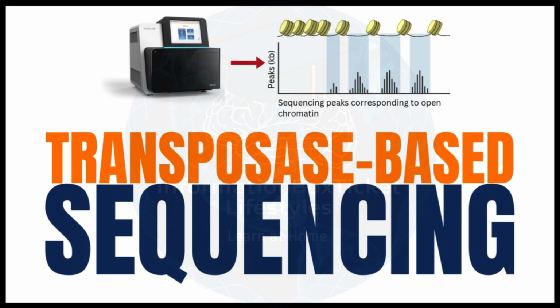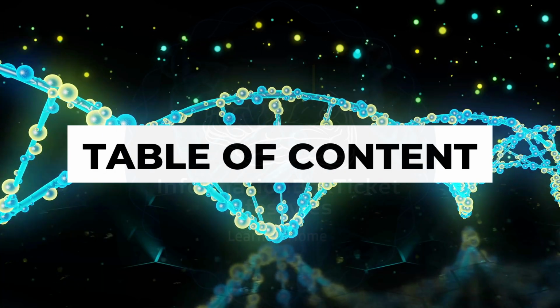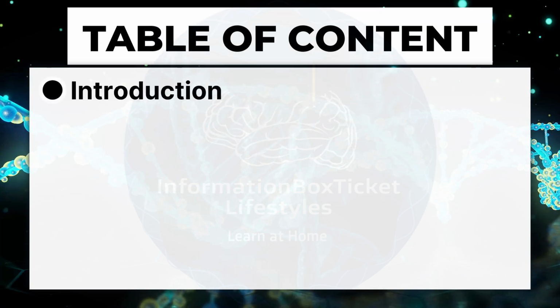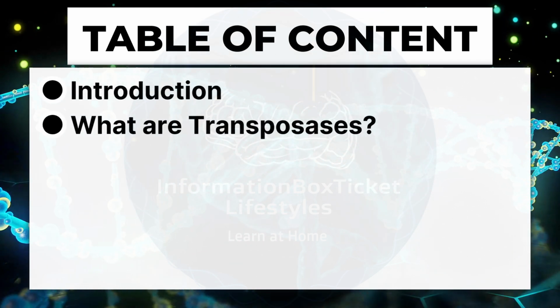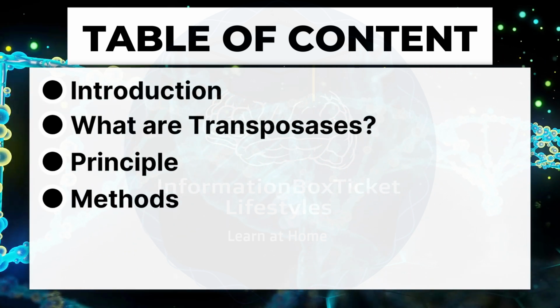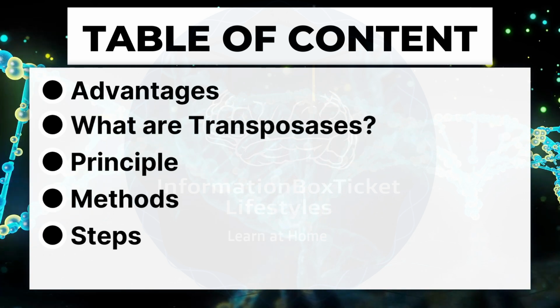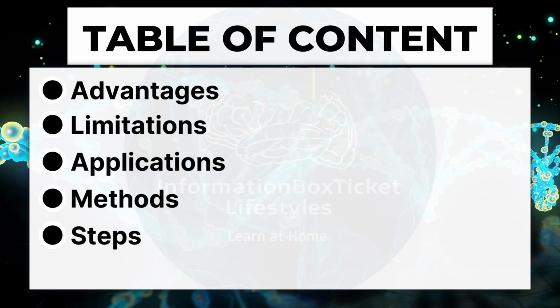Transposase-based sequencing explained. Table of contents. Introduction. What are transposases? Principle. Transposase-based sequencing methods, steps, advantages, limitations, applications.